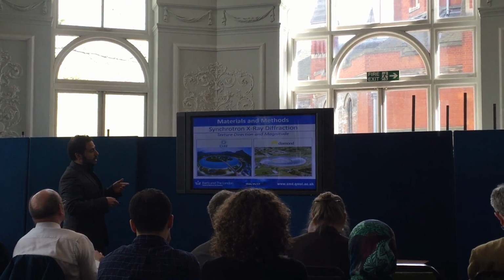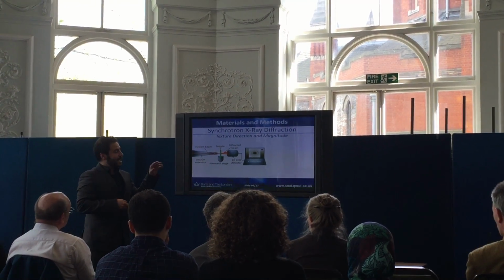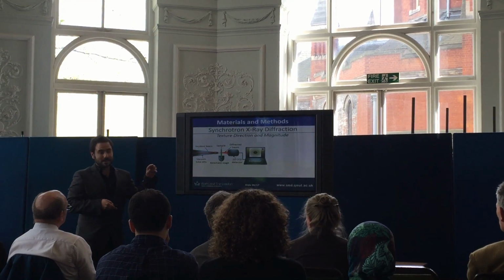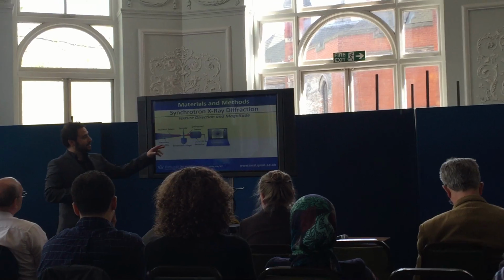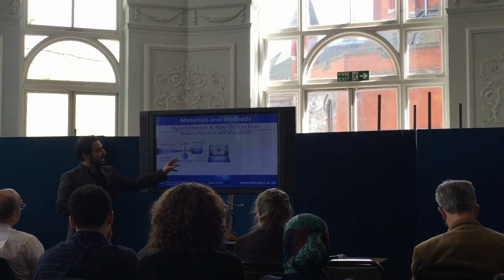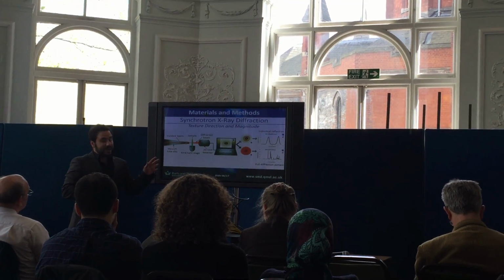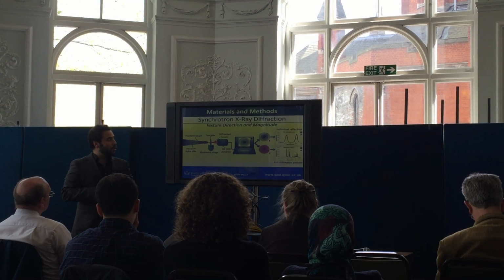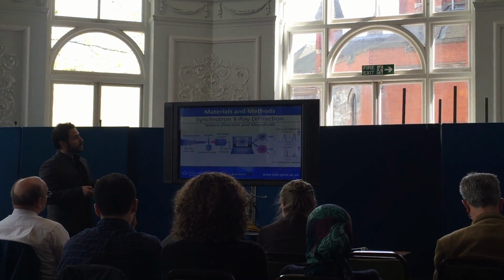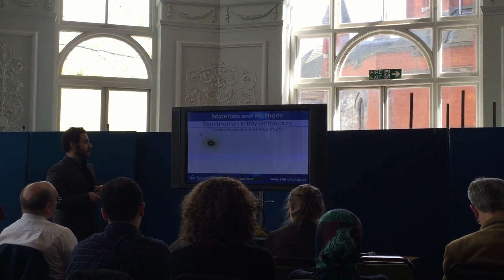This technique involves hitting our sample with X-rays. The crystals within our samples diffract the X-rays, and then it's detected by the detector, giving the following diffraction pattern. These diffraction patterns can be analyzed as a whole to get a full diffraction pattern, or we can choose a specific reflection to analyze, which I did in this research.